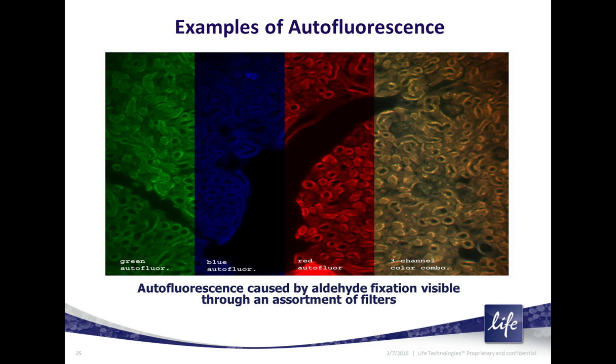Oh, finally, some imaging devices like Zeiss 510 Meta confocals, for instance, or Leica SP5 will have spectral deconvolution systems where you can subtract out the autofluorescence just based upon its spectrum.